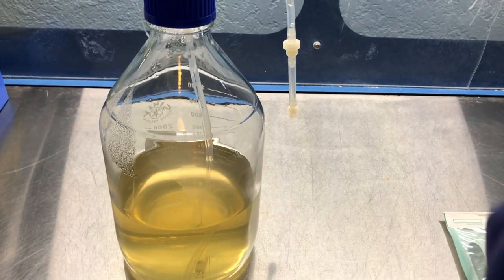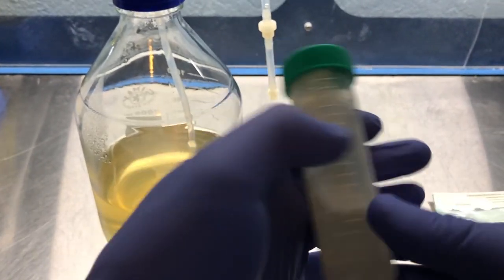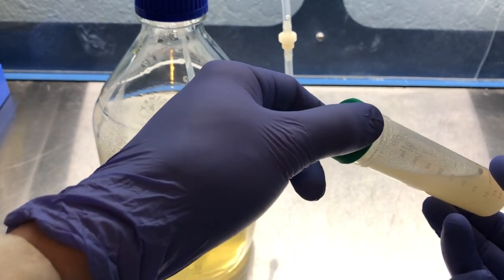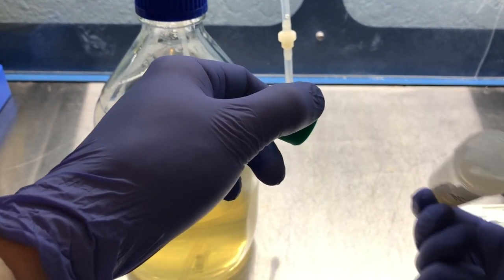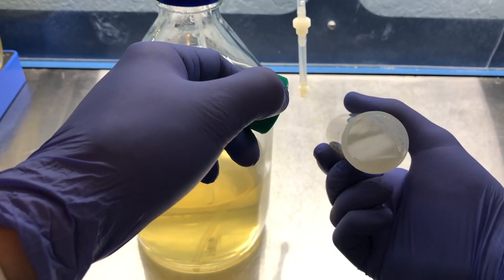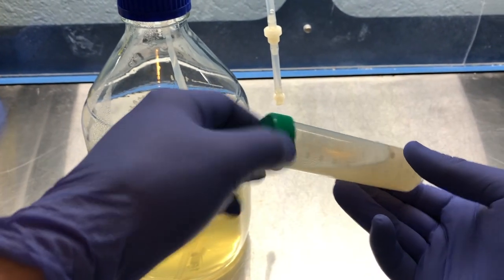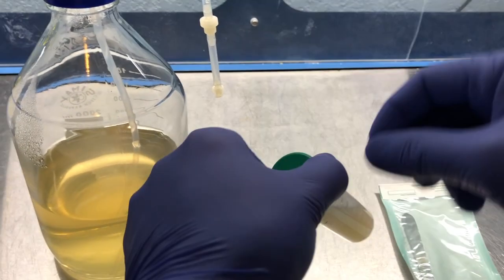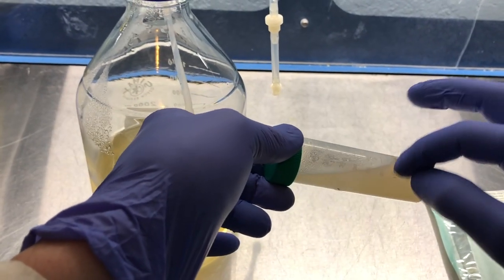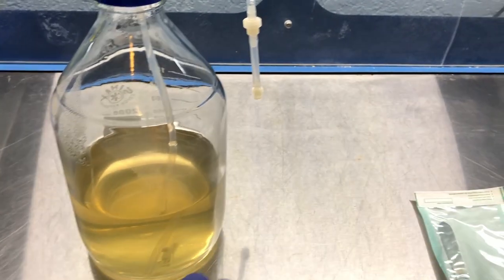That's a normal feature of the cordyceps, but I always make sure that mine's still white and healthy. So I'm going to open this slant up. Check one more time to make sure there's not any contamination, and you can see how nice and clear that mycelium is. Super healthy. I'm going to be cutting a piece near the top so that I don't have to go deep into the slant and possibly contaminate any of it. So I'm going to be selecting my culture from up near the top.